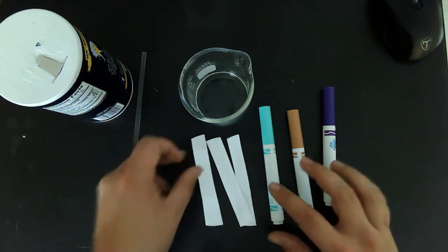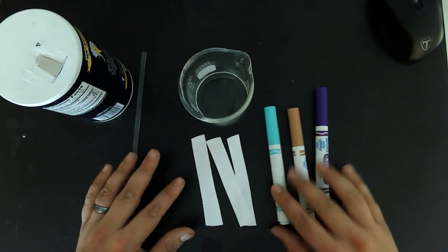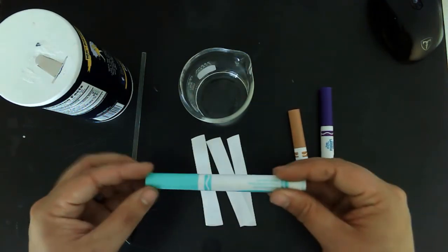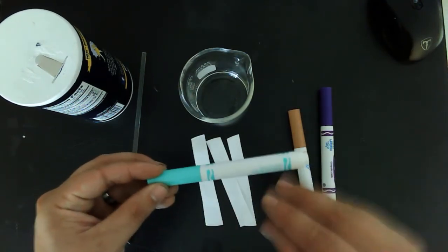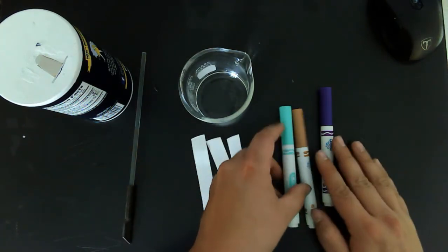So we're going to test what pigments are in these three markers. Is this seafoam green only this green color, or is it a mixture of two different pigments or three different pigments? Same thing for the brown and the purple.